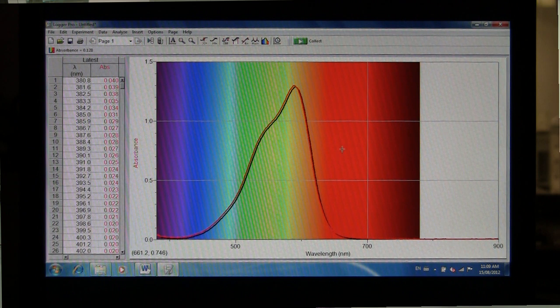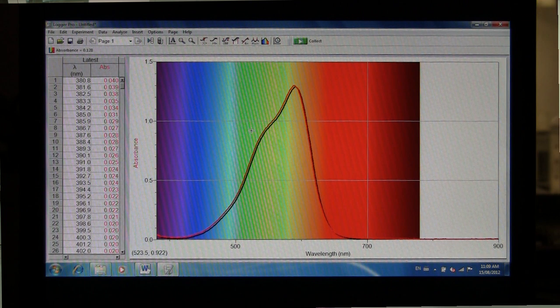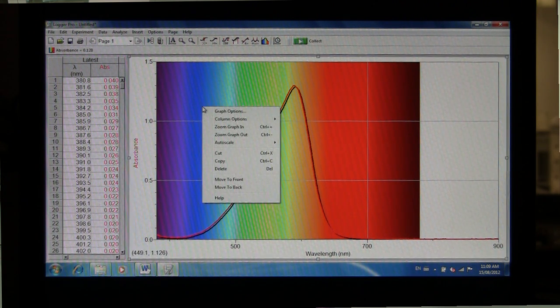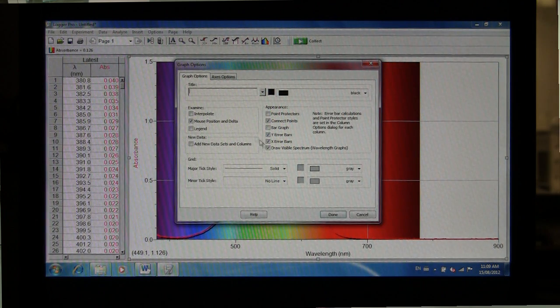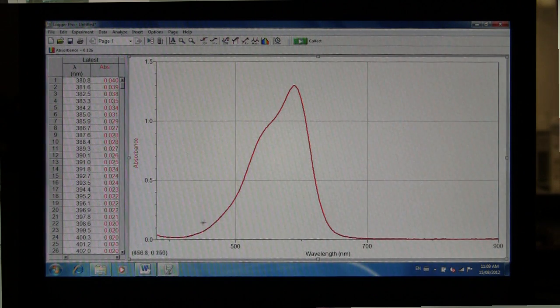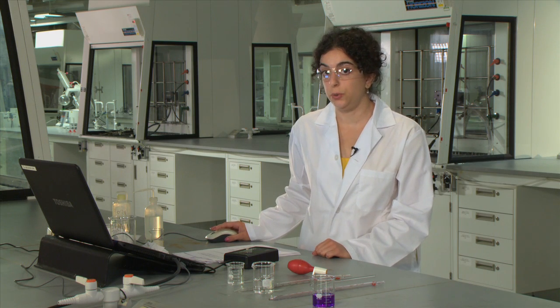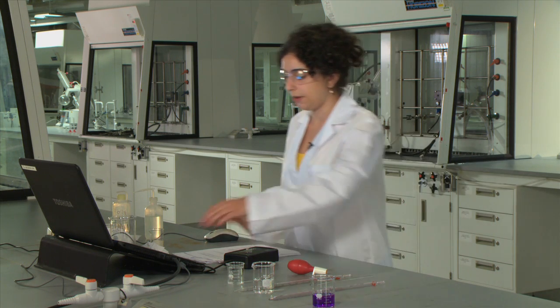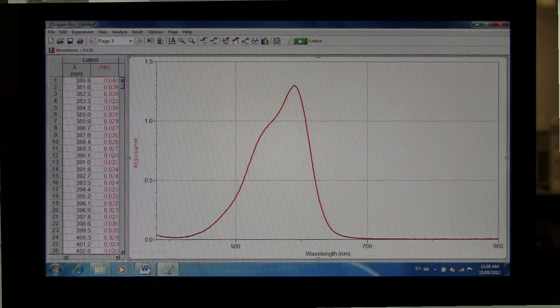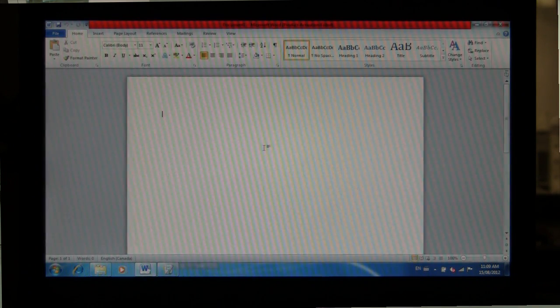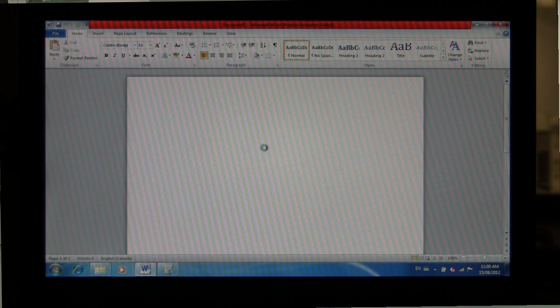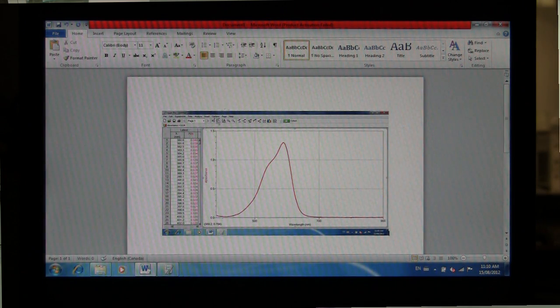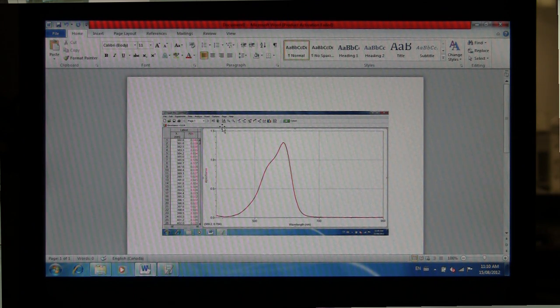And then some additional things that you can do is that you can remove the background spectrum by right-clicking on the graph, select Graph Options and uncheck Draw Visible Spectrum. Click Done, and then you have a much clearer picture of your graph. Make sure that you save this graph. To do so, hit Function Print Screen on your laptop, and paste the picture in Word. Make sure that you save this Word document so that you can obtain printouts of your spectra later on.